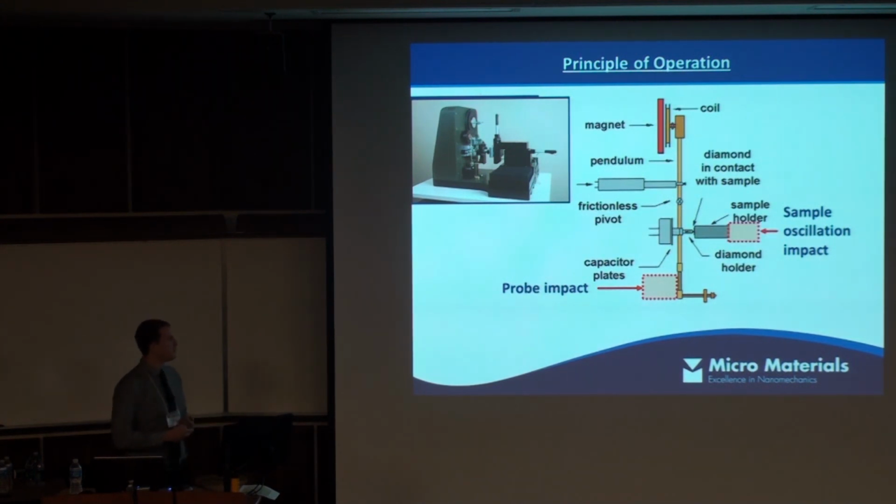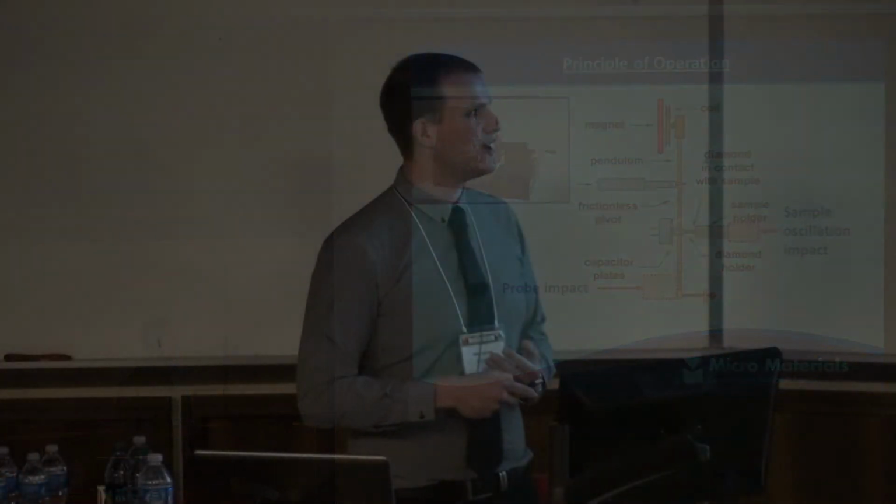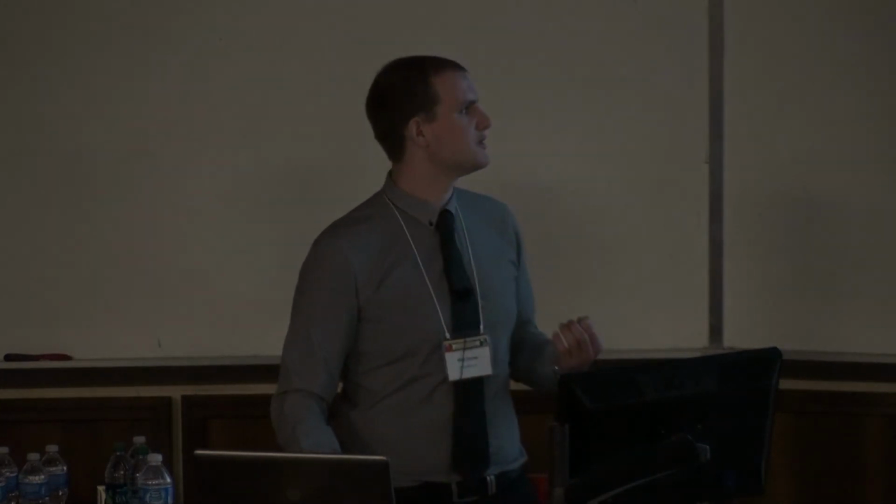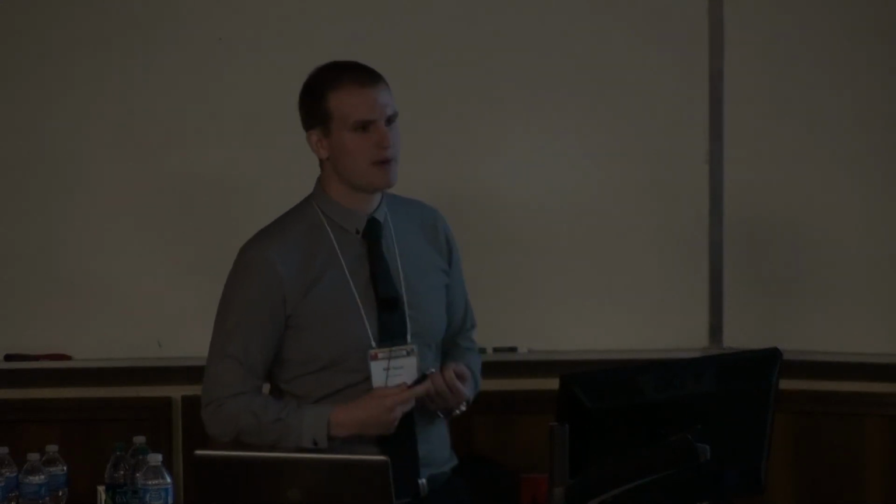As I mentioned, with the sample oscillation impact, what we do is we apply a known frequency and amplitude of oscillation to the sample and measure the change in depth over time. What I'm going to focus on today is the probe-based impact, because this is the kind of testing that allows you to get the very high strain rates for these tests.